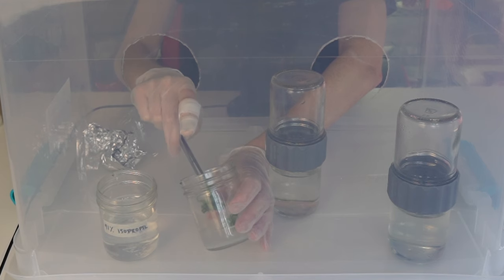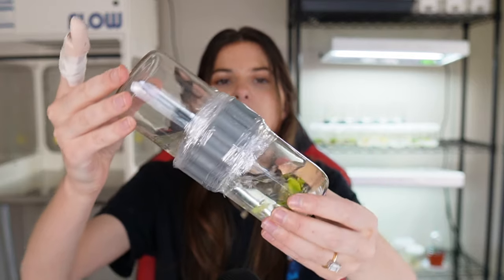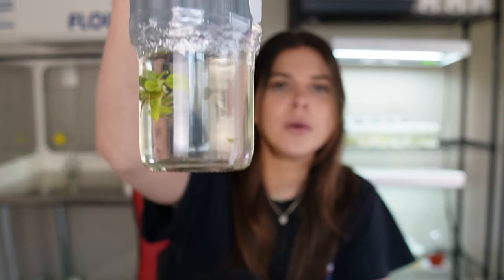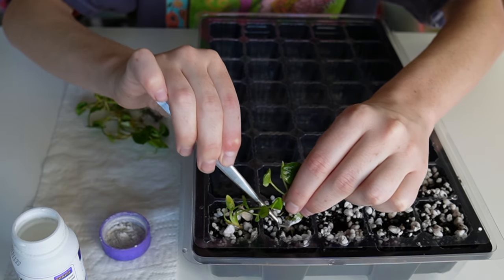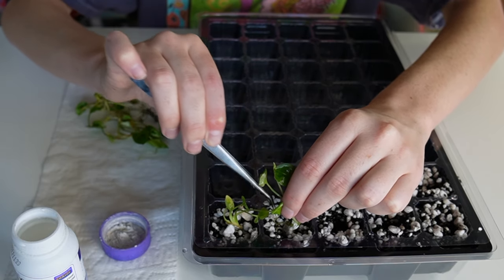Welcome, tissue culture enthusiasts! In the past, I have shown you how to put plants into tissue culture to grow and multiply them, and today I want to show you how to take plants out of tissue culture and acclimate them to being in soil.